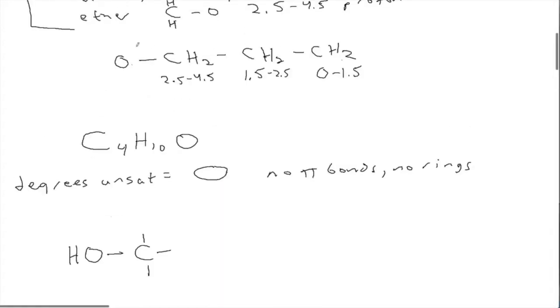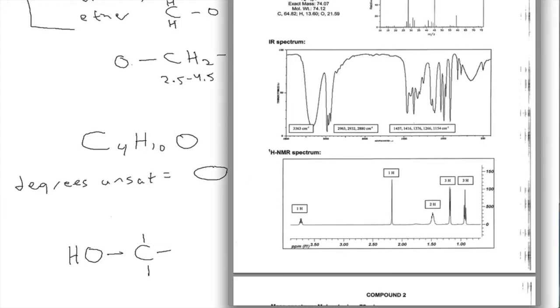What I was hoping to use was these ideas here. Once you've identified the most electronegative group, it should be easy to find the hydrogens that are close to the electronegative group. So it would be the one to the far left that has the ppm greater than 3.5. Notice how that's pretty much a sure thing, because what other reason could there possibly be to be shifted so far to the left?